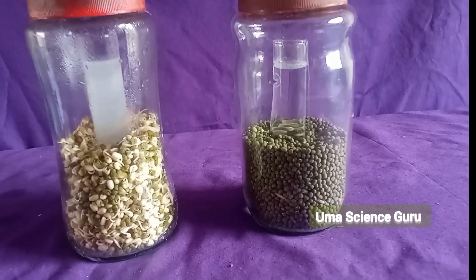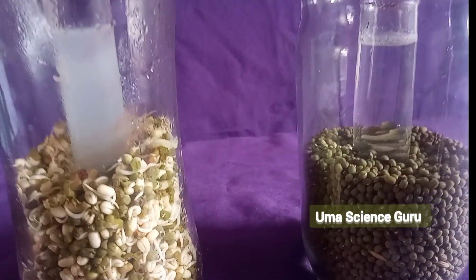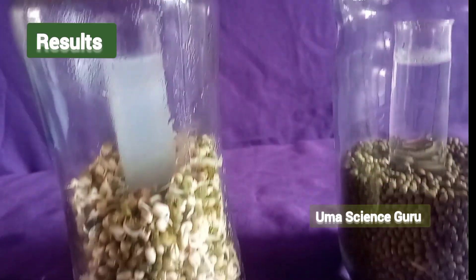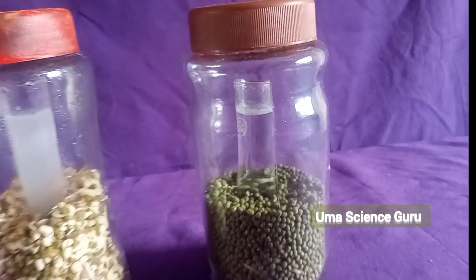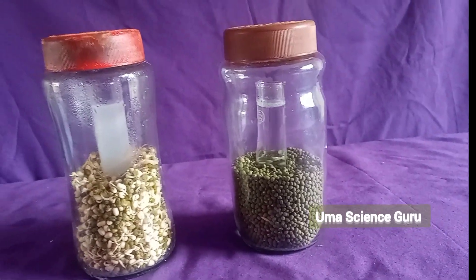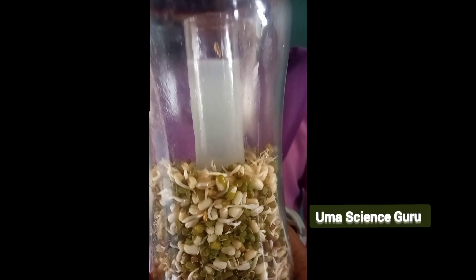After two days, observe what happens. Observe the color of lime water in both sets. The lime water present in the bottle containing germinated seeds has changed into milky white, more than the other one.